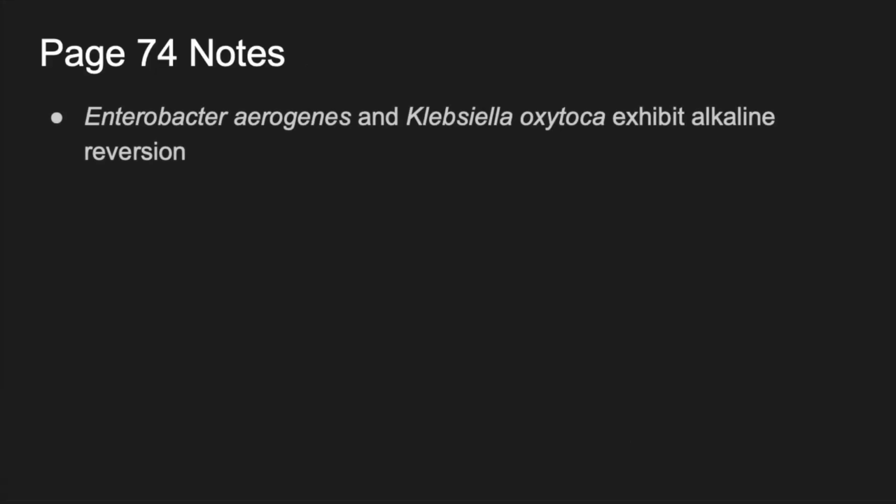Enterobacter aerogenes and Klebsiella oxytoca exhibit alkaline reversion. So just jot that down. Enterobacter aerogenes and Klebsiella oxytoca exhibit alkaline reversion. If you can't remember what that is, go back and remind yourself.